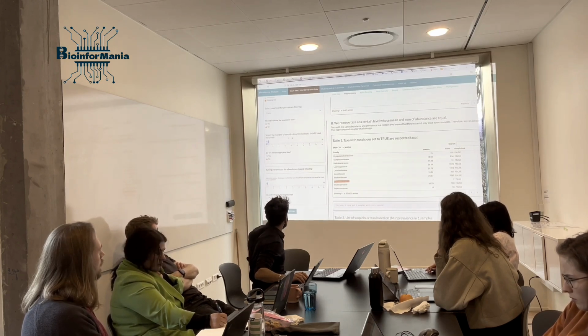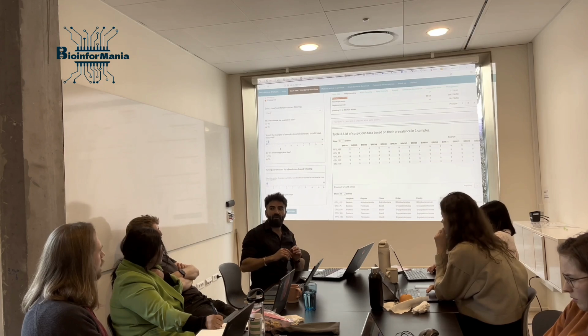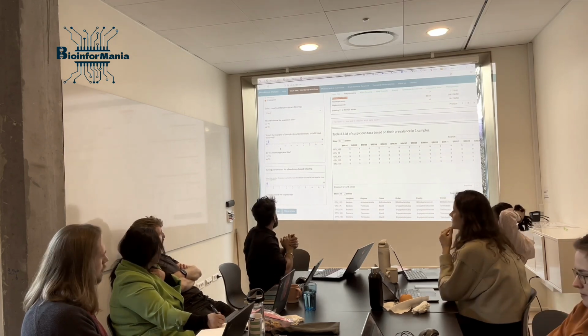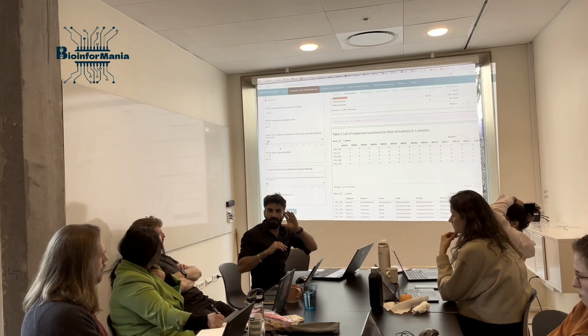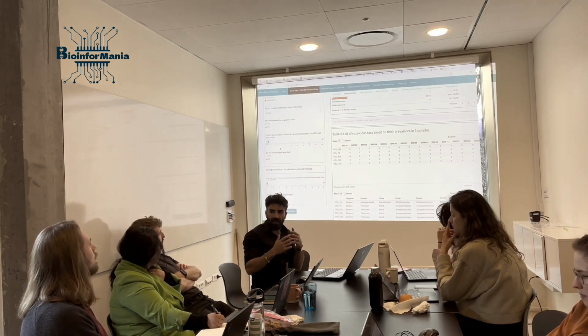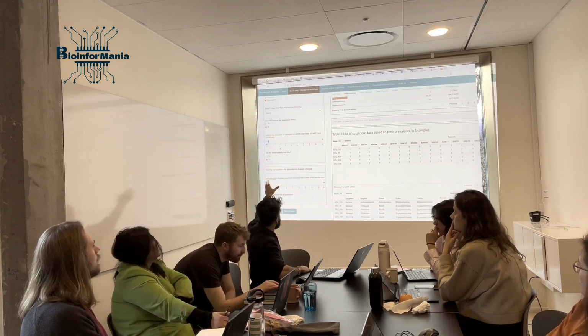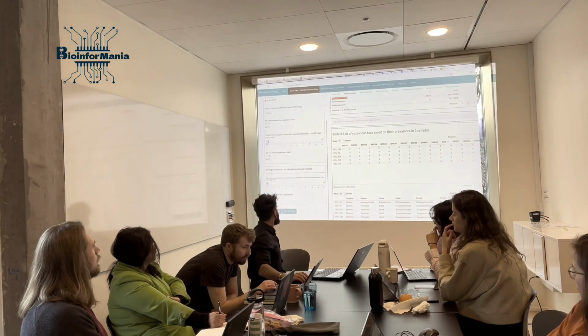And then here it goes down to this criterion. I'm saying how many samples one taxa should occur in to be considered an actual biological variant. Like I talked about, if you have a controlled study design with treatments and everything, you need to be a little bit lenient in selecting yes to this one.